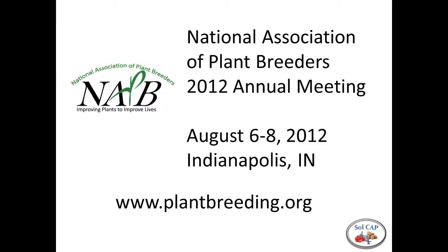And another question here, wondering if you've tried to integrate linkage maps that you've created in JoinMap into your pipeline, or if you thought this might be an easy thing to do. It's not easy. But JoinMap will do that, of course. I have not done it, but of course I think JoinMap would be an appropriate program to try to do that.